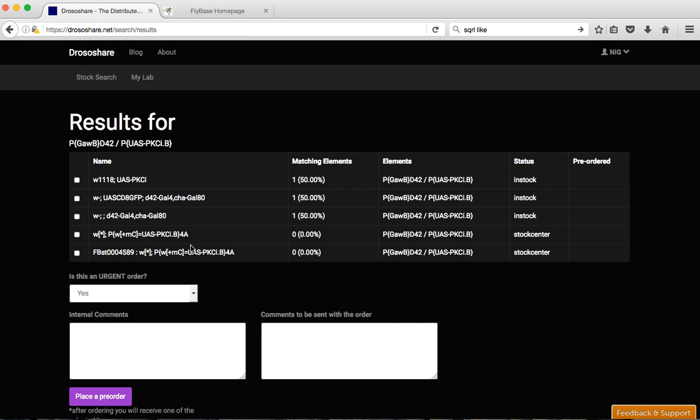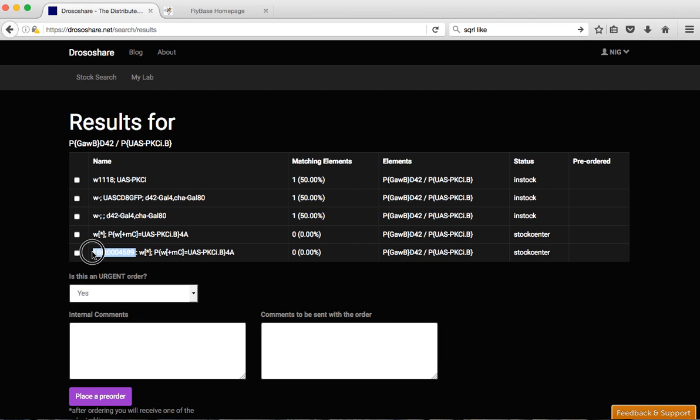And you see already here that we have PKC Isle lines, two different ones. This one is from the Kyoto stock center and this one is from Bloomington stock center. It's the same line. But as you see here this is flybase stock number meaning that this is the Bloomington one.